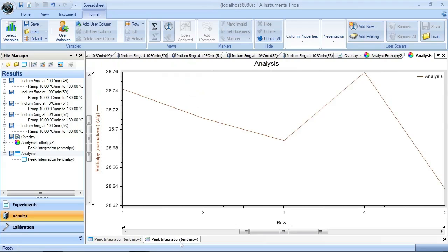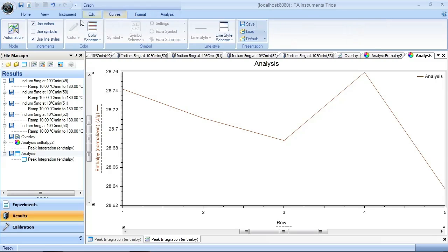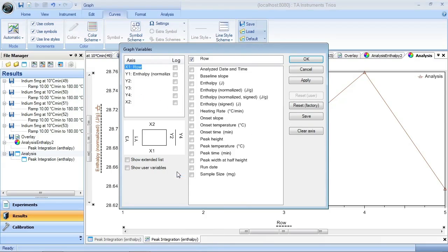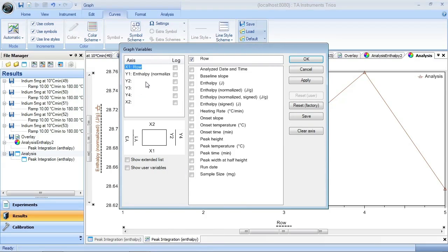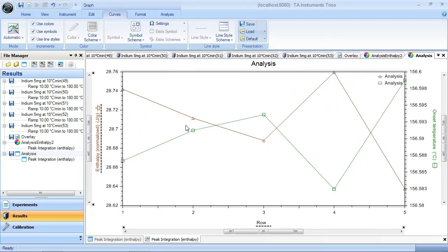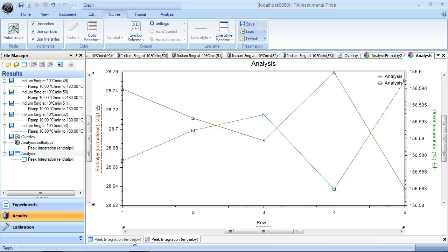I can show the symbols for each of the data points. I can configure this graph. I could show, let's put onset temperature on another axis. So now I can plot my enthalpies and my onset temperatures. So it's a really useful feature for analyzing these results.